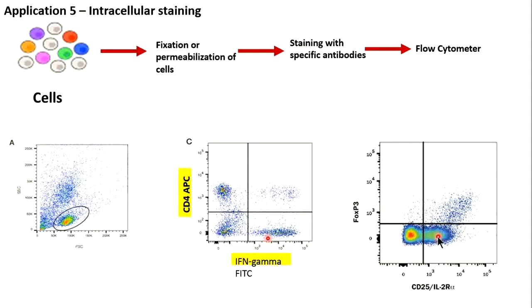Okay, and you can analyze them. What if your protein is present inside the cell? What if I want to analyze whether a particular transcription factor is present inside the cell or not, expressing inside the cells or not? So the question is simple and the answer is more simple. Yes, we can analyze them if we can send our antibodies, fluorescent tagged antibodies, inside the cells.